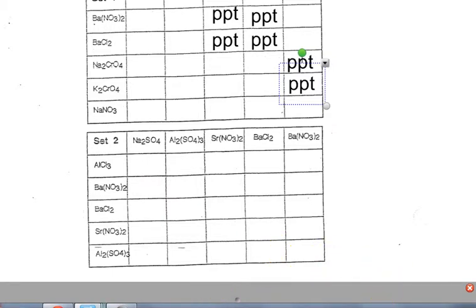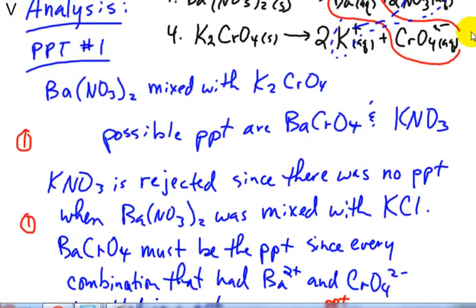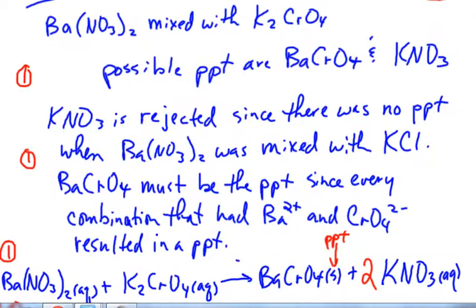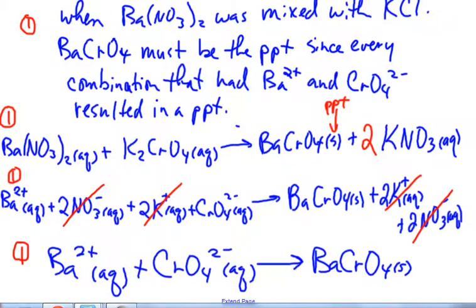So this procedure of figuring out what precipitates there are in a particular box and then keeping one and rejecting the other one, you have to do it only 2 more times for the 2 different precipitates. Okay? So run through that.